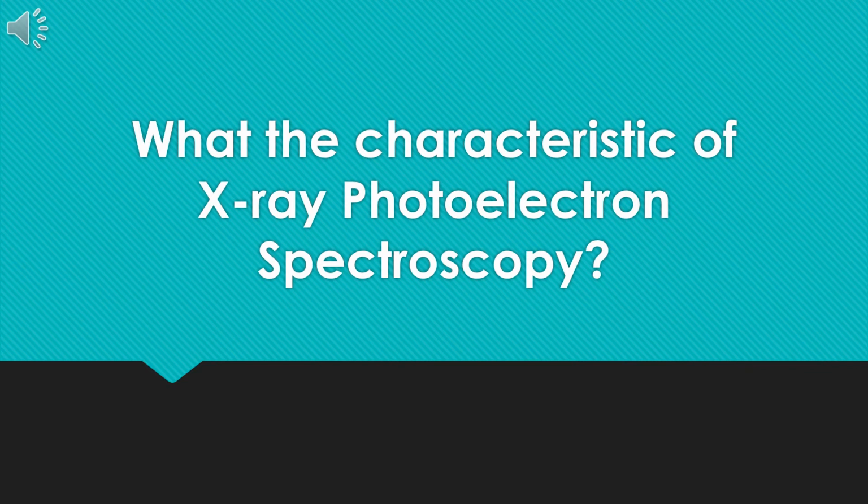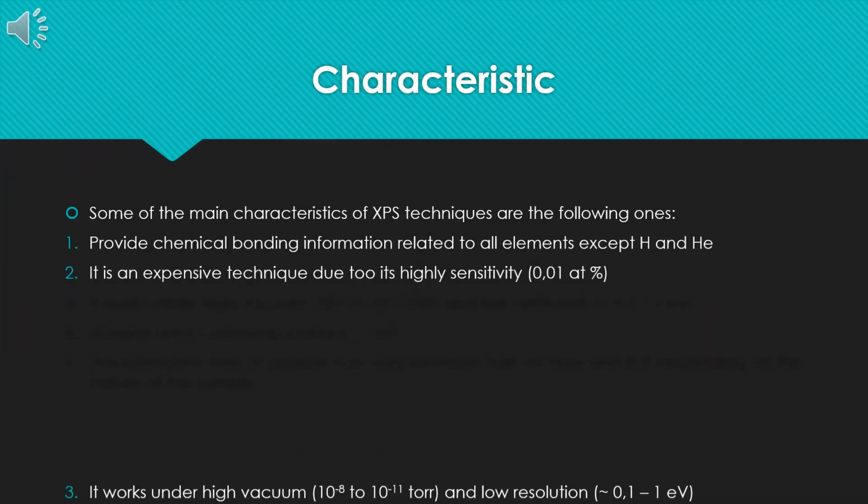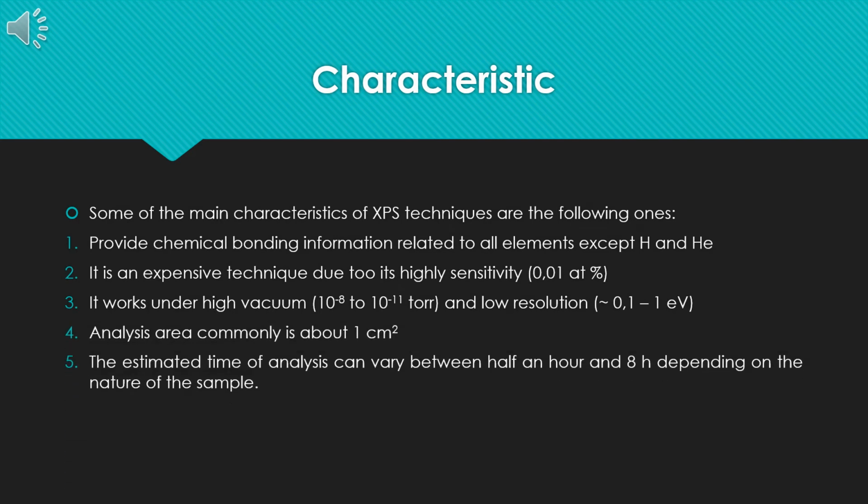For the next slide, we will discuss the characteristics of X-ray photoelectron spectroscopy. Let us know the characteristics. Some of the main characteristics of XPS techniques are the following.